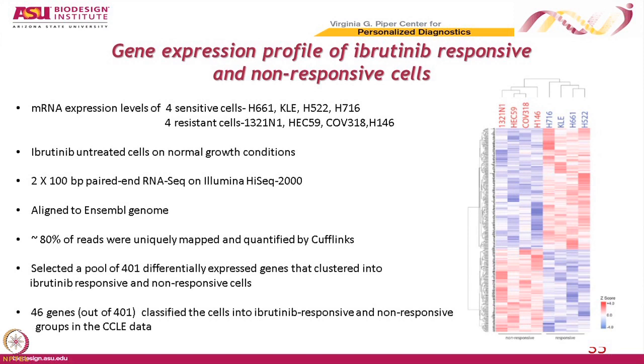We ran that. We did them in untreated cells. We did that because we kind of wanted to know what was at baseline. We also did the treated ones, but that gets more complicated. We did high-seq sequencing, assembled them into genes, identified which genes were responsive, and then compared these results among this population to data where these cell lines had been looked at in the CCLE data. So we had our own RNA-seq data, and we also looked at the CCLE data. I'm not going to go through all of the informatics that we did to sort this out, but in the end, what we did was look at which gene pathways were best correlated with responsiveness.